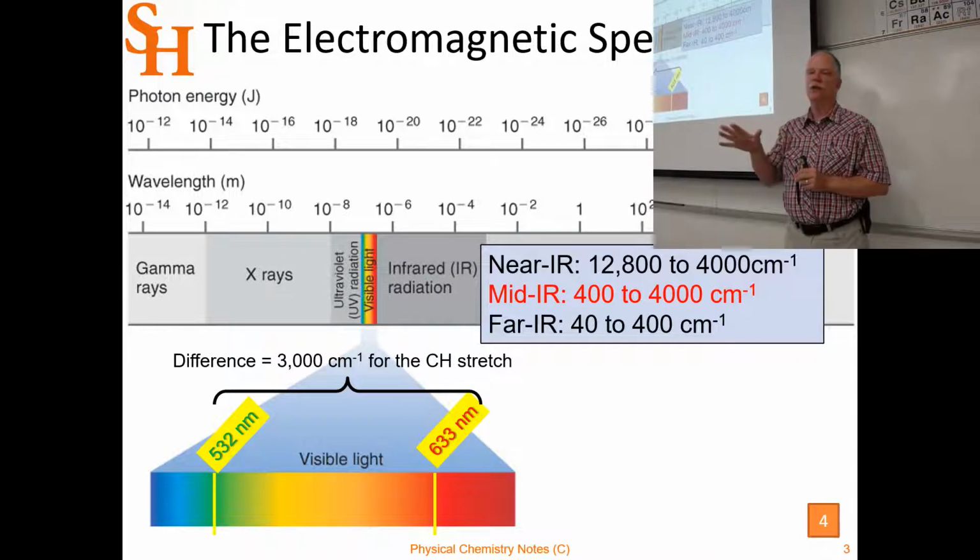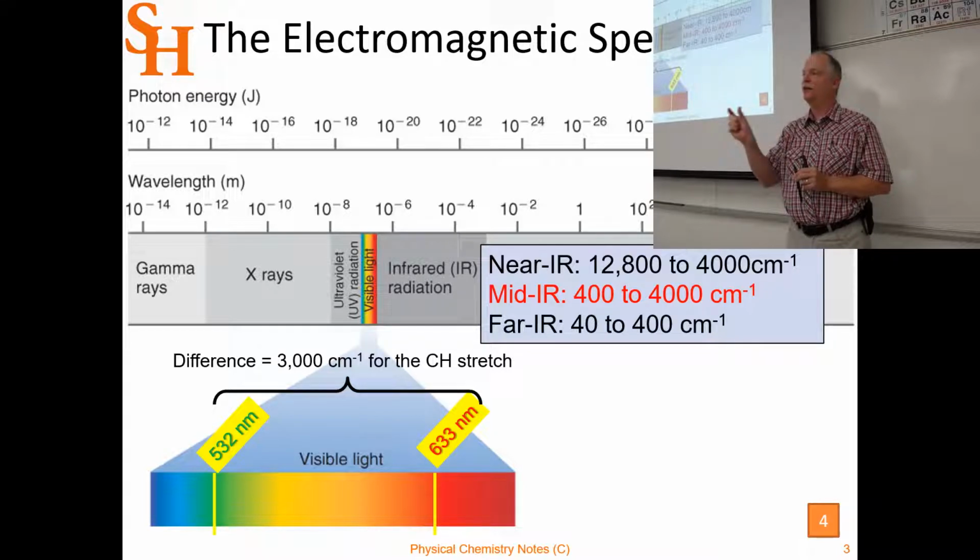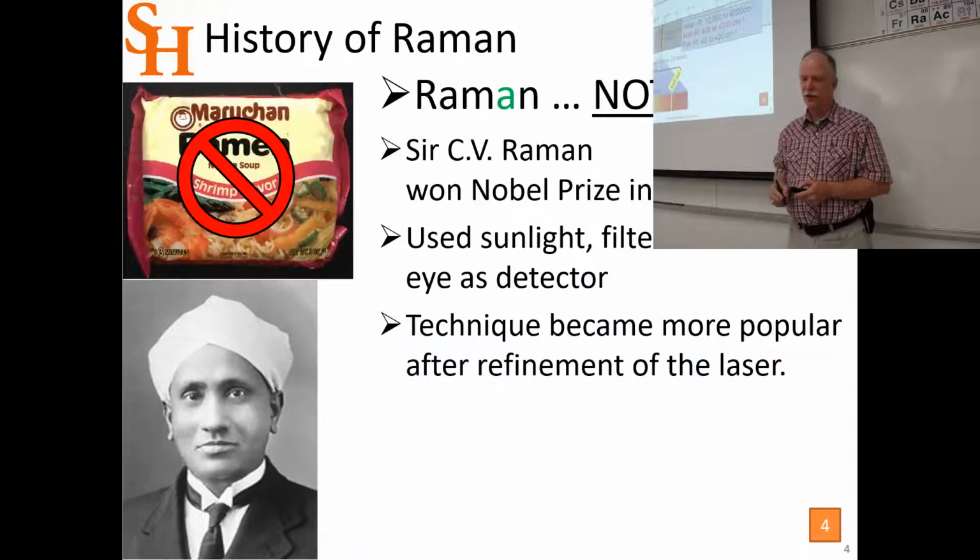And if we were to disperse those colors and send them onto a detector, we would get the visible spectrum. You'd see all these peaks that correspond to the Raman effect. If we plot the difference between 532 and all of those peaks, then we get the vibrational spectrum that we can line up with the FTIR. So what we're plotting this week in lab is actually Raman shift. So it's the wavelengths that we detected minus the incident wavelengths. And so that difference is the vibrational differences. We'll see that in an energy level diagram here in a second.